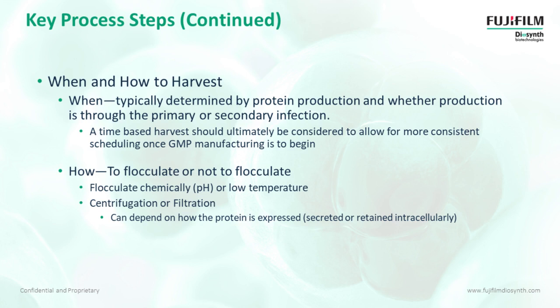And then using centrifugation versus filtration, there is a lot of depth filtration that's used in our processes if it's an excreted product, and our preference obviously is to use the depth filtration. But again, with a lot of cell debris and that sort of thing in the process, sometimes that's a little bit more difficult, and then centrifugation becomes the preferred mechanism for harvest.